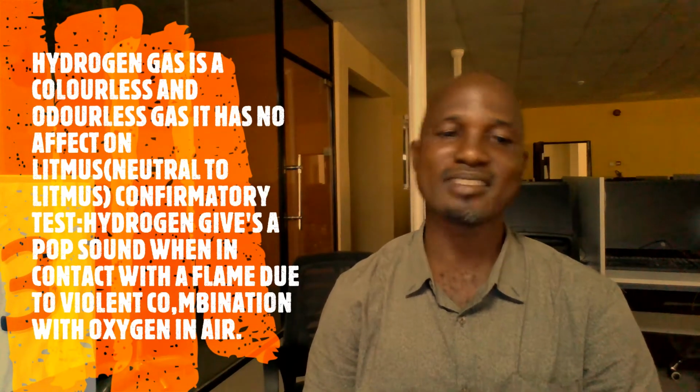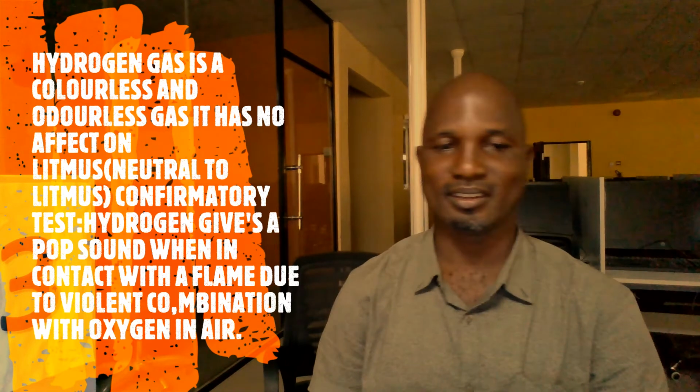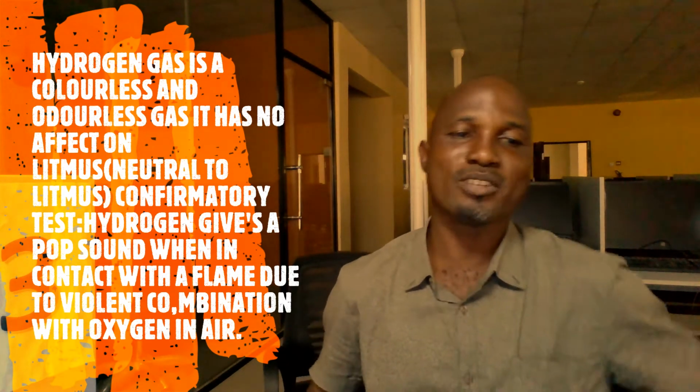But hydrogen gas is colorless, is odorless, and of course the confirmatory test for hydrogen gas is that it gives a pop sound. Pop, P-O-P, when a flame is passed over it. This is due to the violent combination with oxygen. When hydrogen combines with oxygen, this reaction is usually violent. Don't try it because it's dangerous.